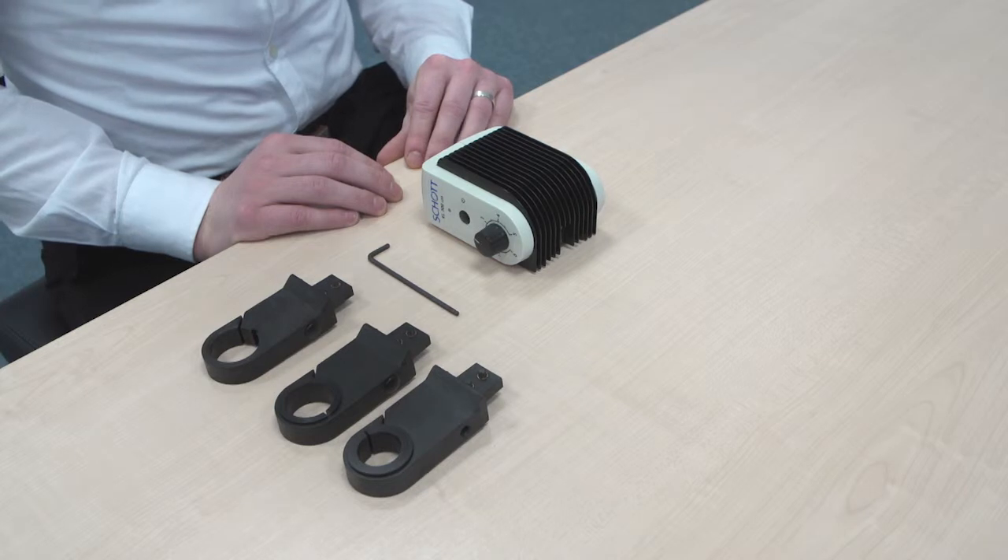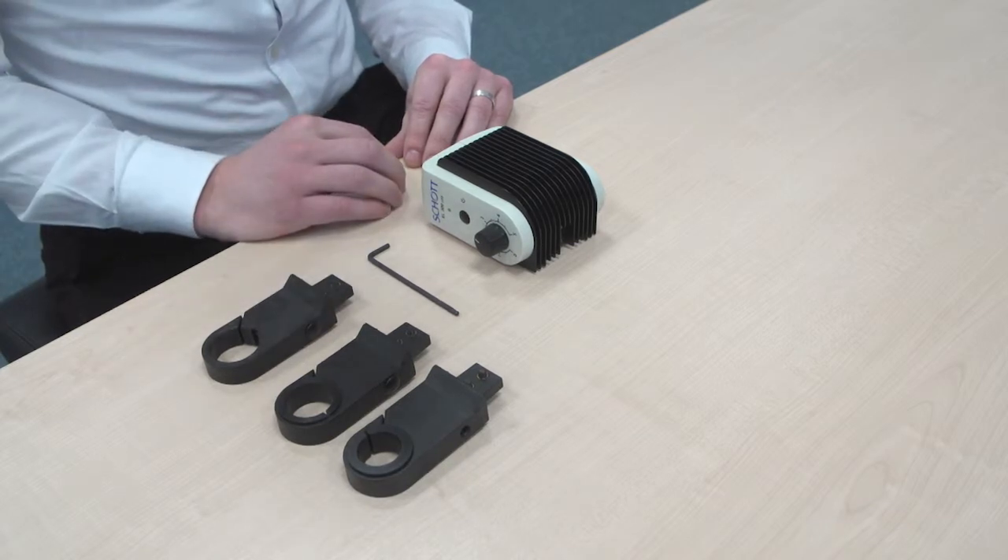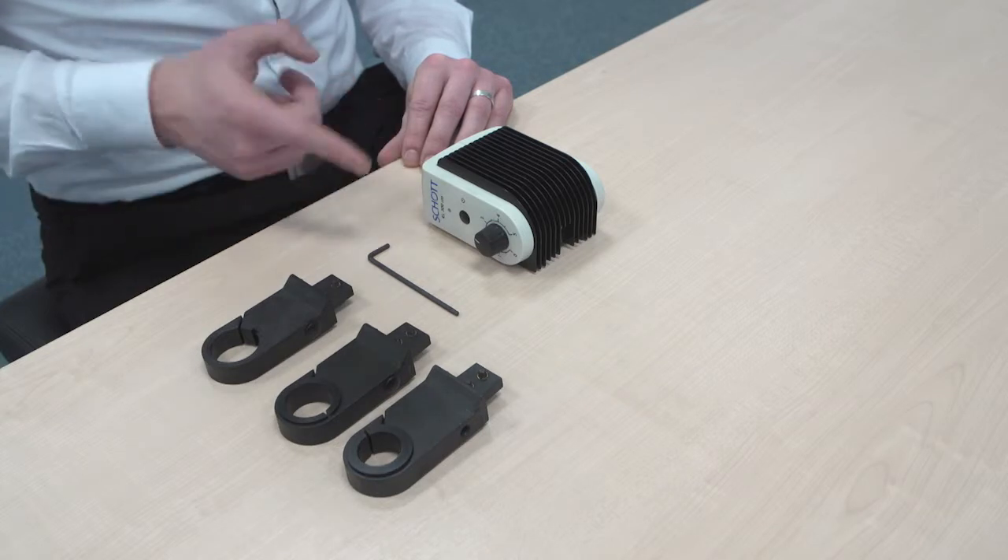you'll first need to determine the right diameter that you need to connect it. As you can see here, we have three different connectors with three different diameters. These are sold separately. Also for the installation, you'll need an Allen wrench.